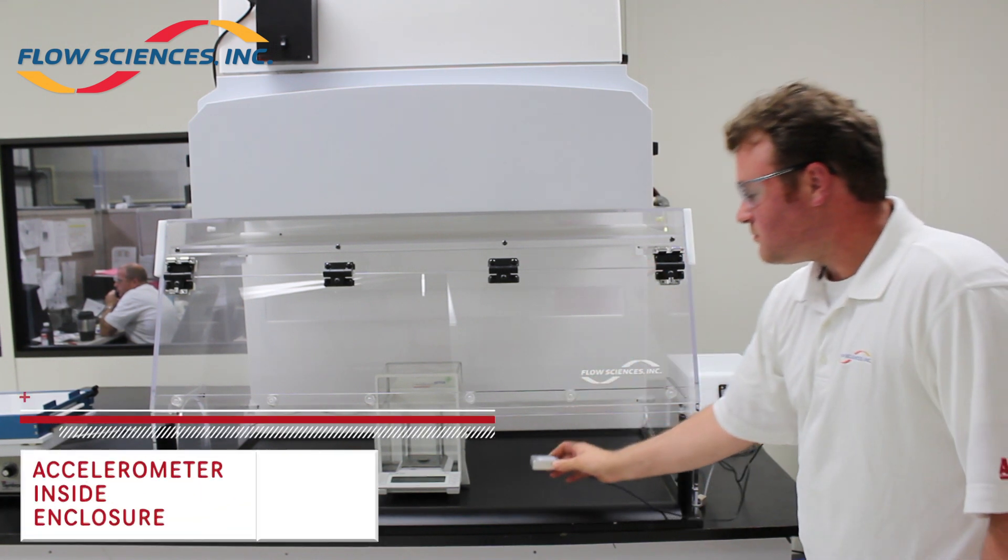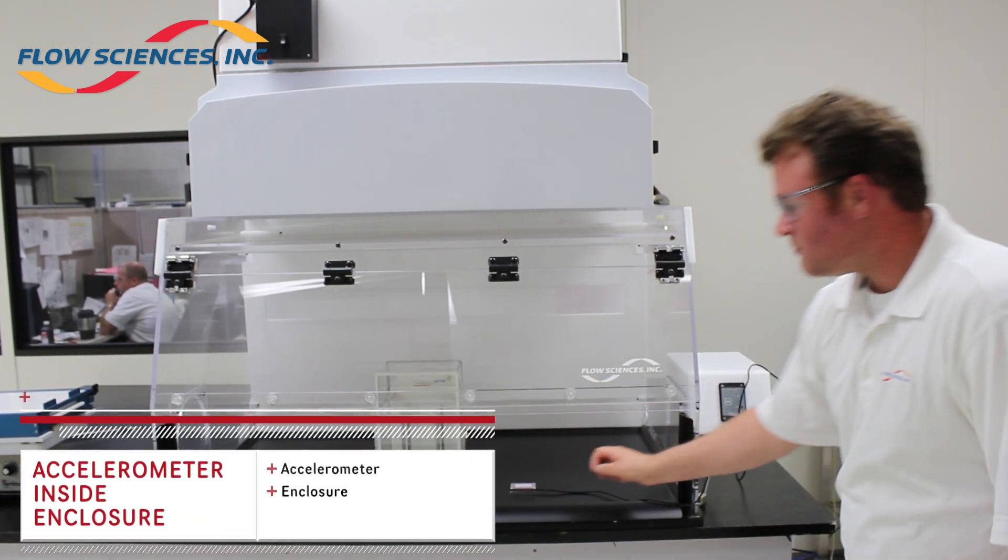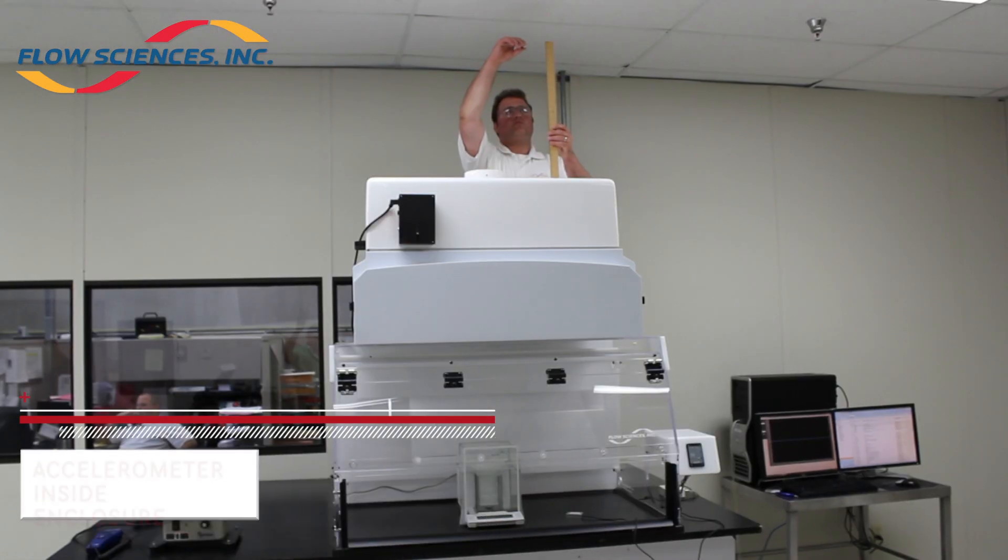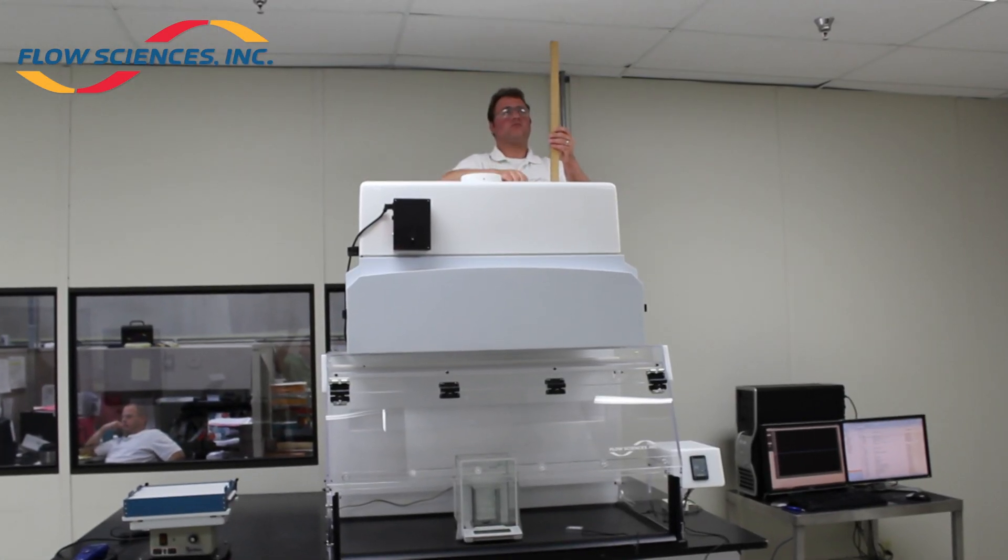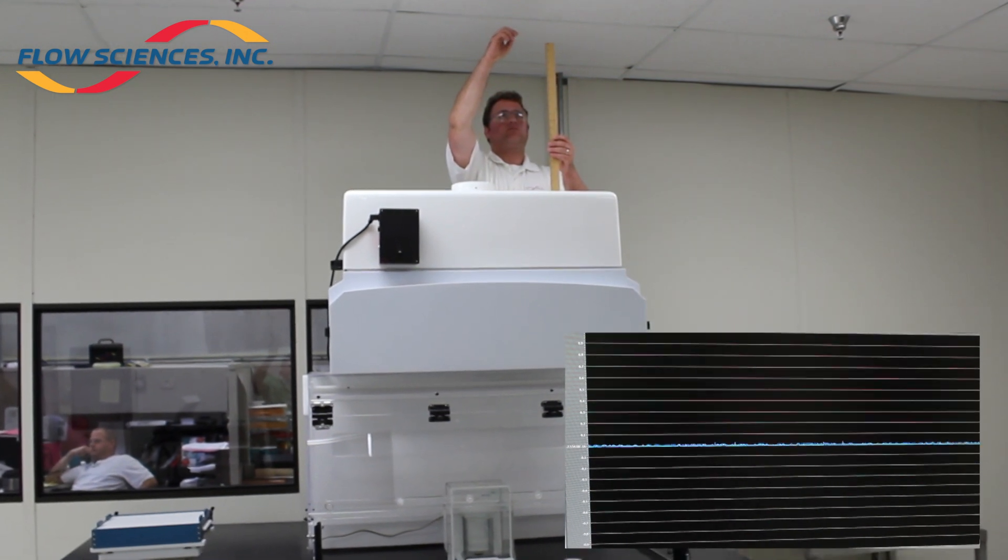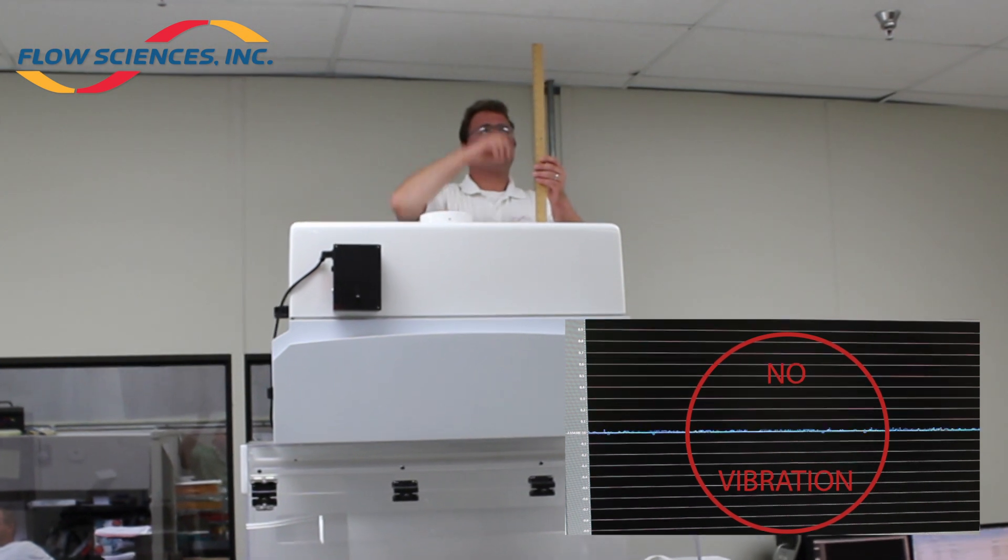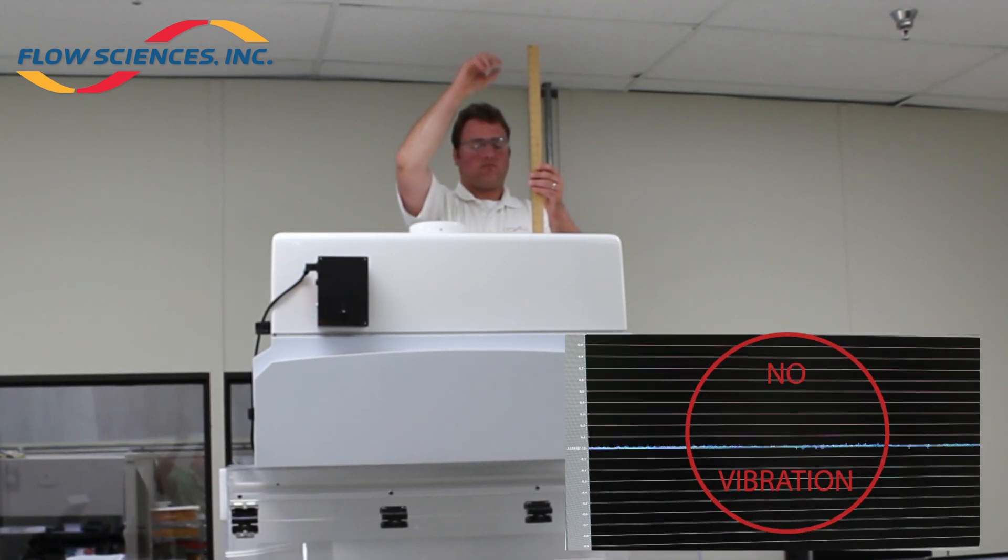Test 7: With the fan still turned off, the sensor was placed inside the enclosure centered on the phenolic work surface. The same steel ball was again dropped from a height of 2 feet onto the top of the fan unit. This was to see if any vibrations would travel to the enclosure's work surface.